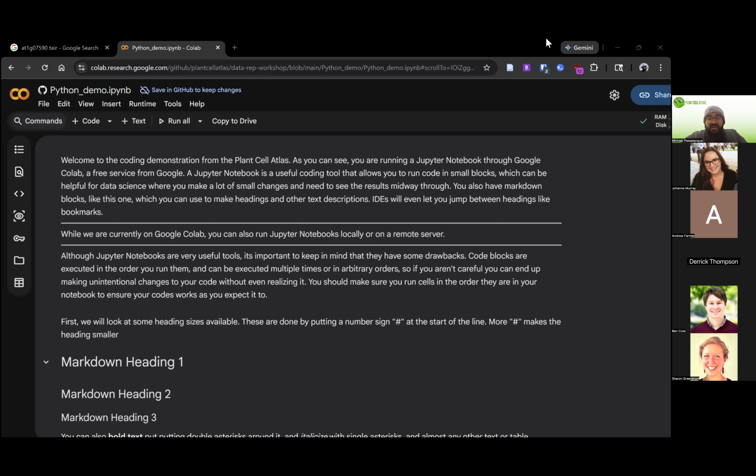Those are great questions. How can I import a Seurat RDS file to analyze with ScanPy? Great question. This is something I do a lot because I have a lot of collaborations, and some people prefer working in R, some people prefer working in ScanPy. You can export a Seurat file to a .loom or to a .hdf5. There's SeuratDisk, or Seurat, I forgot what the other one is, but if you search SeuratDisk, it should come up. Once you've exported them to a Loom or HDF5 format, you can then read that into ScanPy quite easily.